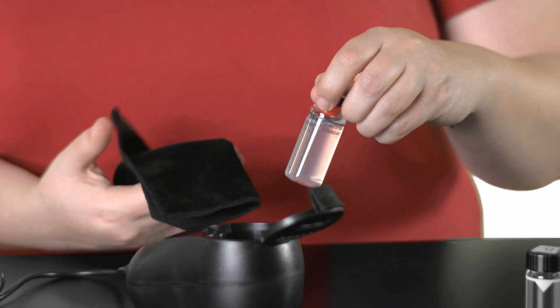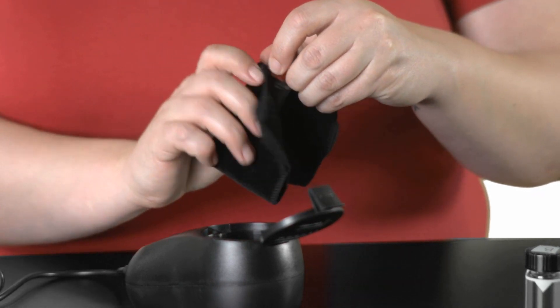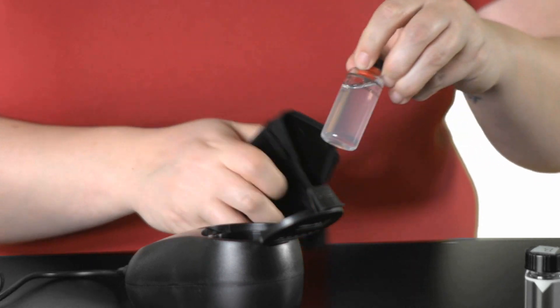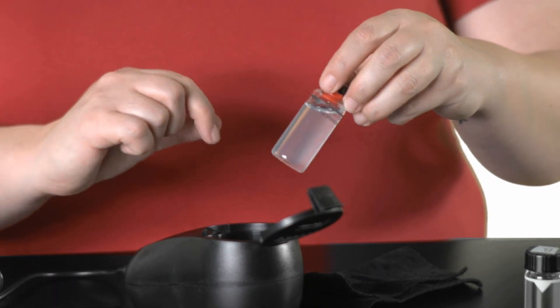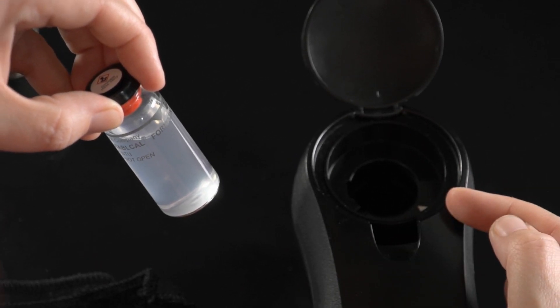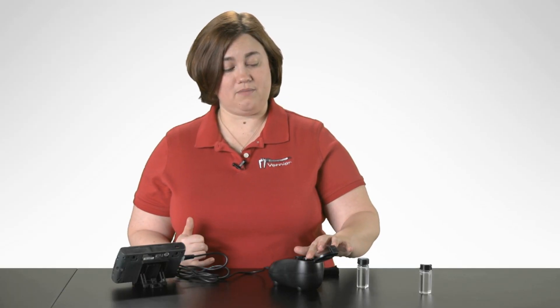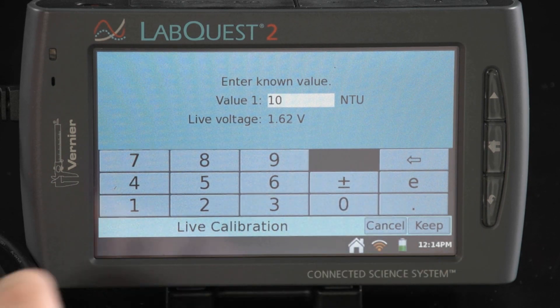I may have touched the outside of my vial, so I want to remove any fingerprints with a lint-free cloth. I wipe the vial with the cloth, then place the vial into the turbidity sensor. I want to make sure that the arrow on my sample vial lines up with the arrow inside my turbidity sensor. I line those two arrows up as I insert my sample, close the lid, wait for my voltage to stabilize, and then enter 100 as my known value.